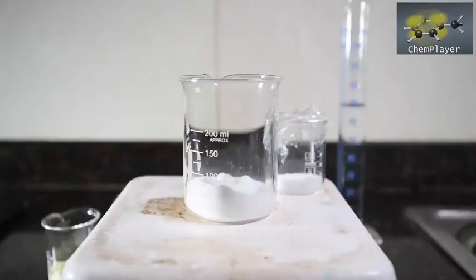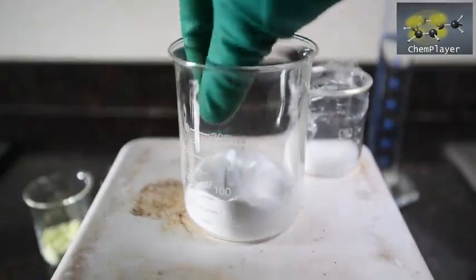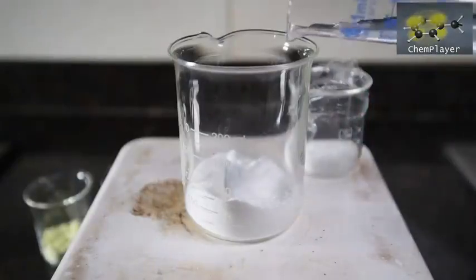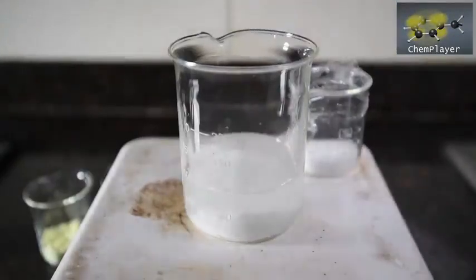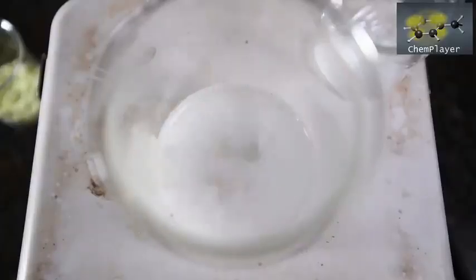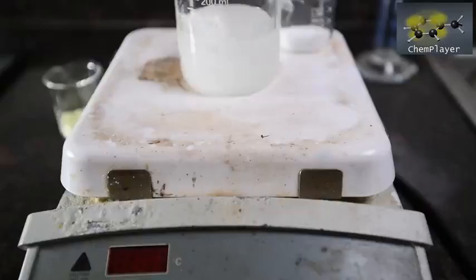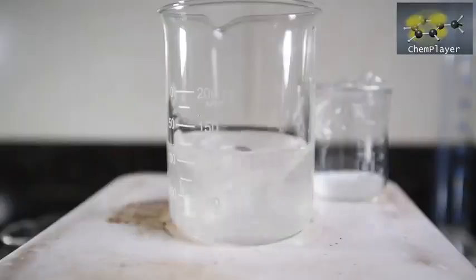We've got the sodium bisulfite in a 250 ml beaker on a hot plate stirrer. We'll place a stir bar in, then add the 70 ml of water and commence stirring gently. Looks like an inquisitive ant didn't make it. We'll get the heating going on our rather battered but still going hot plate — the bisulfite goes into solution pretty quickly.